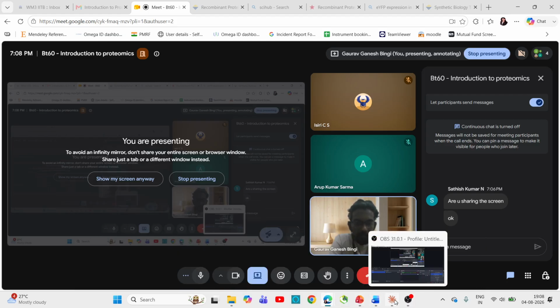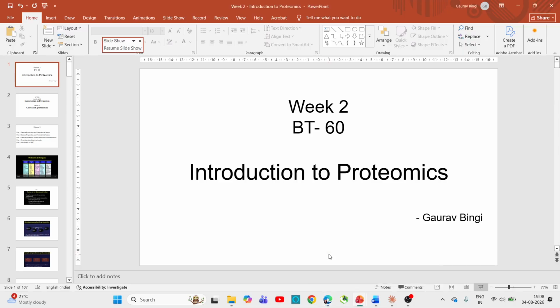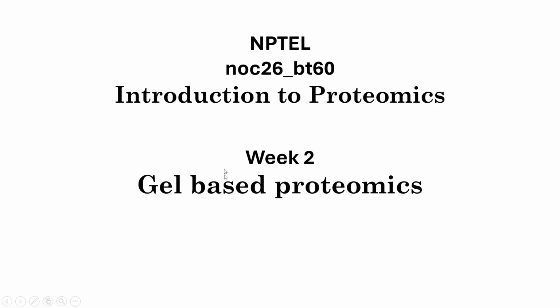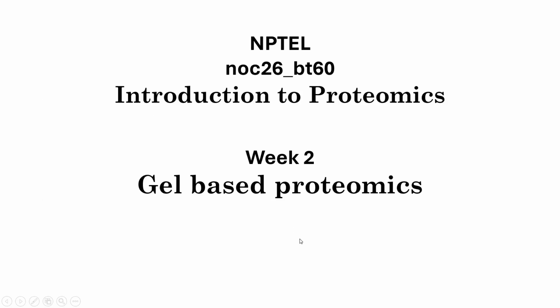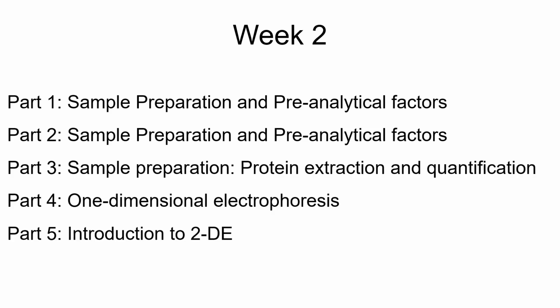So in week 2, it is largely based on gel-based proteomics. Before learning the technique itself, no matter what type of proteomics you are doing, you need to collect the sample as accurately as possible and also prepare the sample for the analysis, depending upon the type of instrument you are dealing with or the type of analysis you want to do to identify your protein of interest or proteins as a whole, whatever your aim might be.